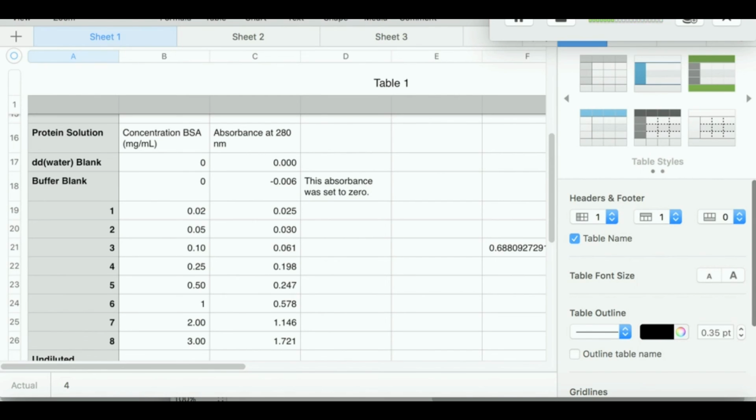So if you're trying to determine an unknown concentration of nitrophenol, you have to do your calibration curve that we just did for paranitrophenol, and you have to determine the extinction coefficient for paranitrophenol. Same thing's true of any compound. The other caveat is that all of your measurements, both for the standard curve that we just generated and for the unknowns, have to be at the same wavelength. It's also true that if I change this wavelength even to 281, the extinction coefficient will also change. That's a problem because then you're going to get an inaccurate concentration when you measure the absorbance.